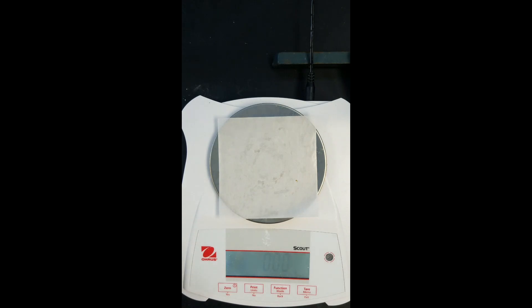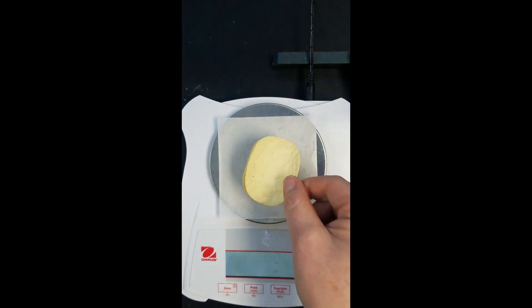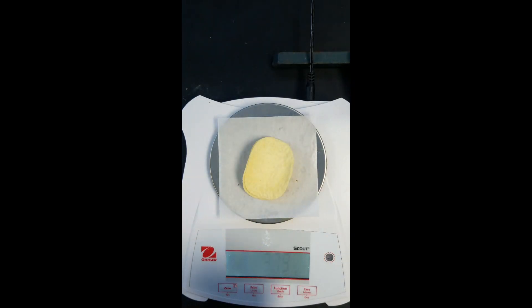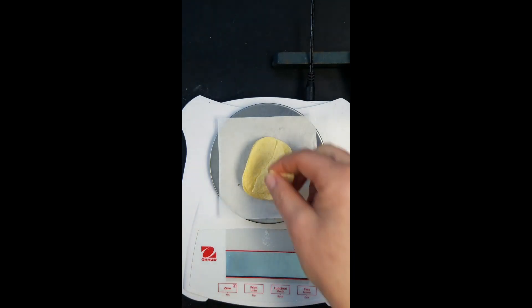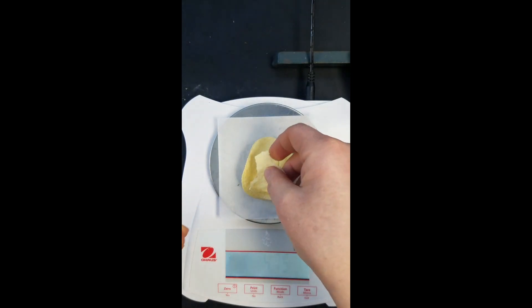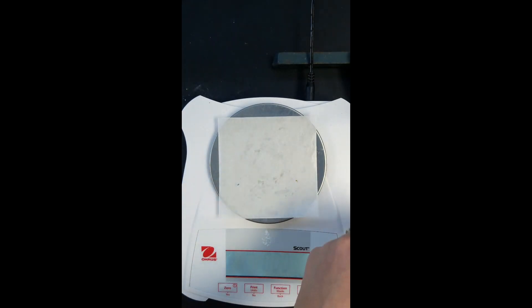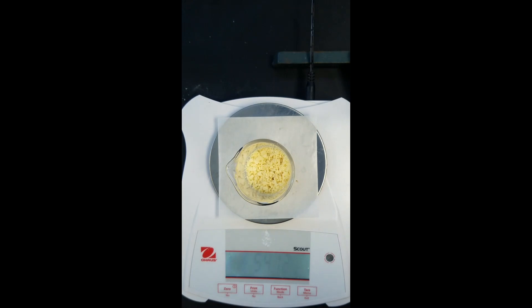Again, we're going to weigh out about 5 grams. We're going to add some chips and add them into our beaker to crush up. Here is our beaker with our crushed Pringles in it.